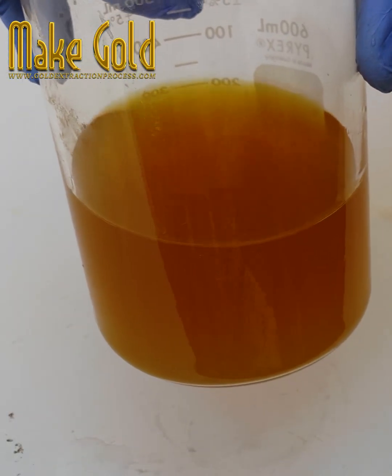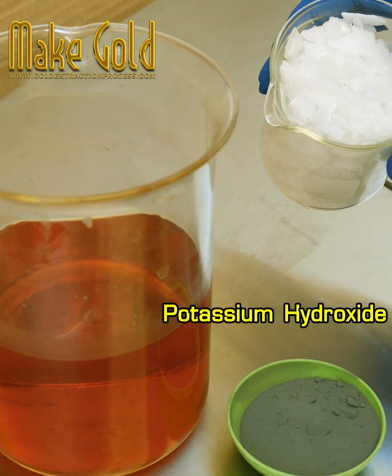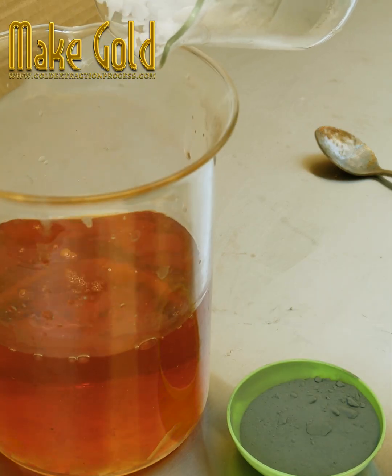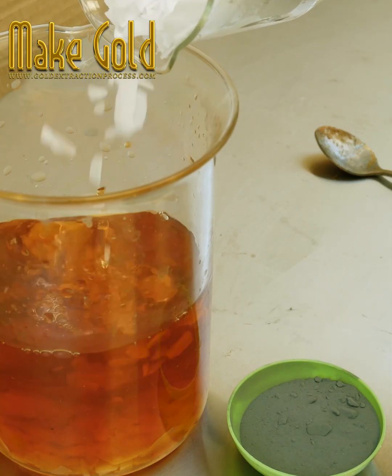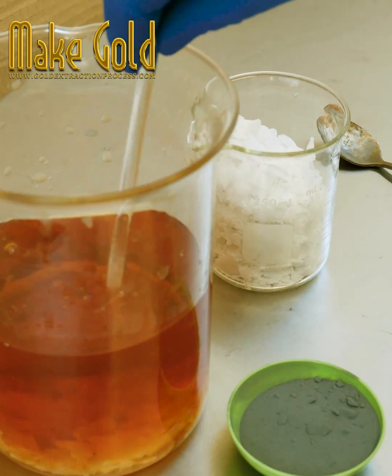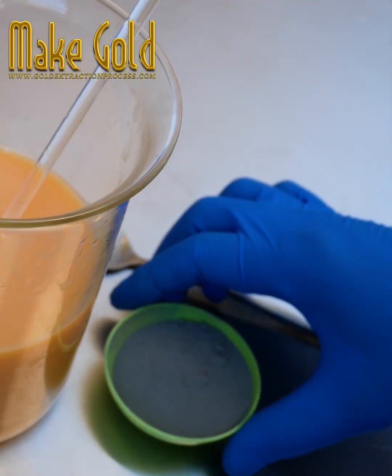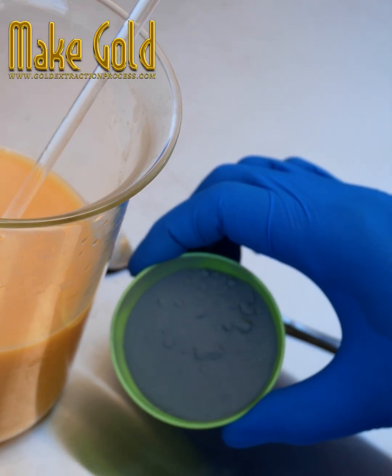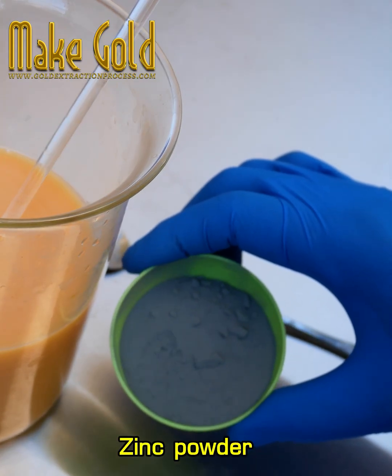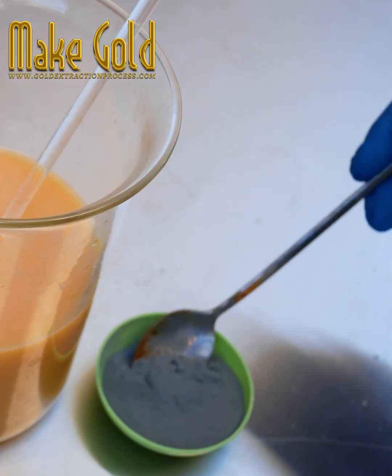I precipitated gold from the gold stripping solution using zinc powder, with potassium hydroxide as a catalyst for gold to adhere to the zinc powder. Then I separated the gold from the zinc powder by using nitric acid mixed with water at a ratio of 1 to 2. You will be left with gold sediments after the zinc powder has been completely dissolved.